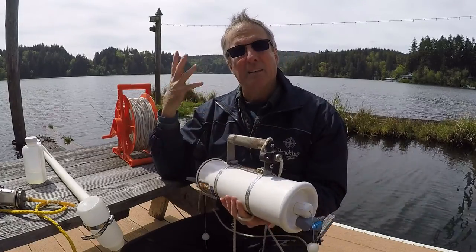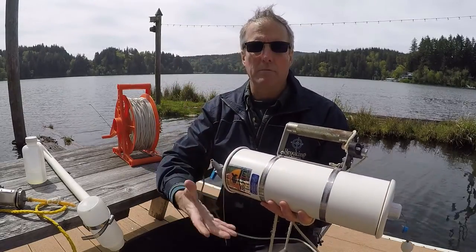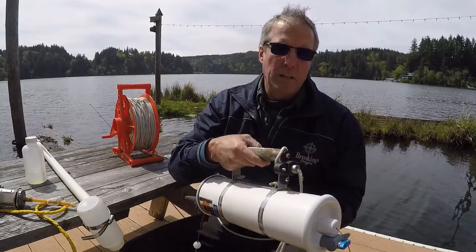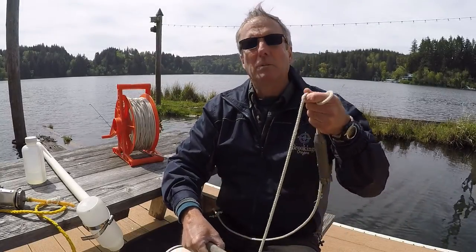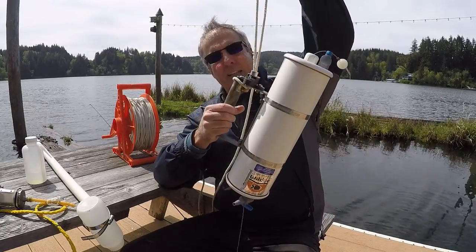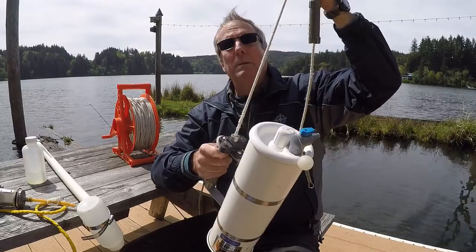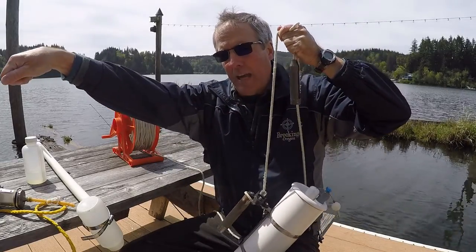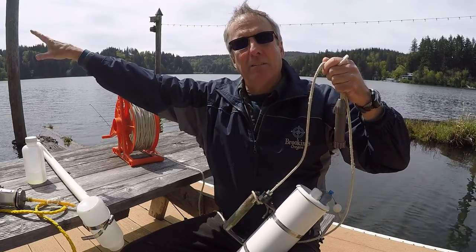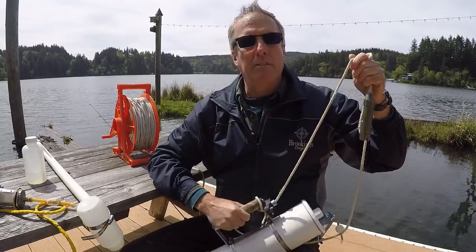Especially in a lake like this that has a lot of sediment in the bottom, a lot of muck that's been down there, that'll kind of cause a little bit of a plume to come up. And we really don't want to sample the water within that plume. So a lot of times what we'll do is we'll find the bottom, we'll raise this up so we find our half meter above the bottom, so something like that. And then when you're in a boat, we'll deploy this off of the bow, but then walk this whole thing with the rope sort of hanging over the edge of the boat all the way around to the other side of the boat, and then let it kind of settle in there, get the water kind of mixed in there from that side of the boat, and then we'll send our messenger down to close it.